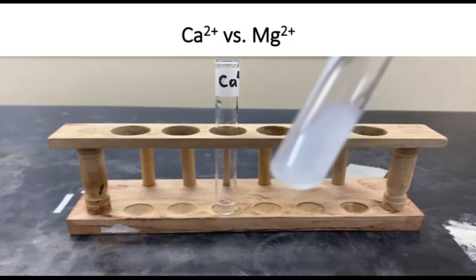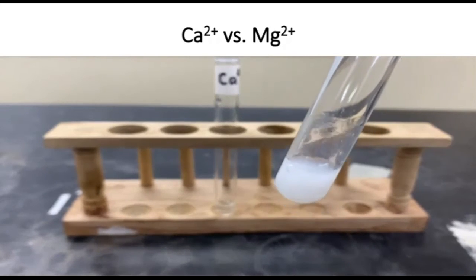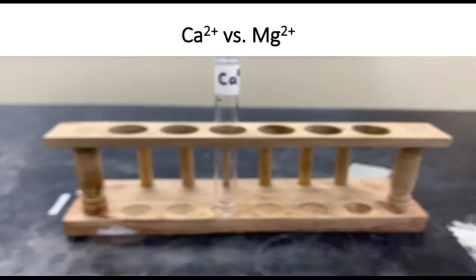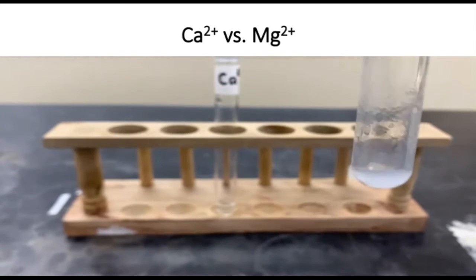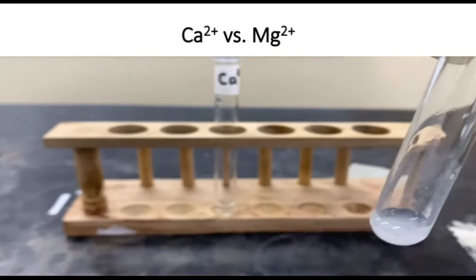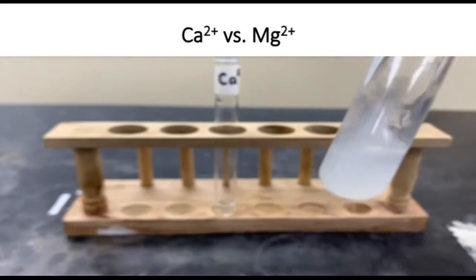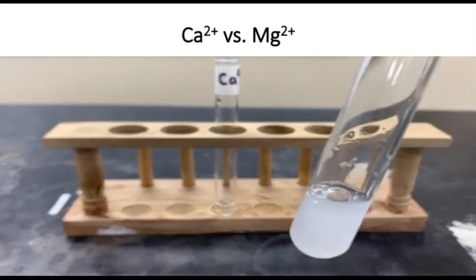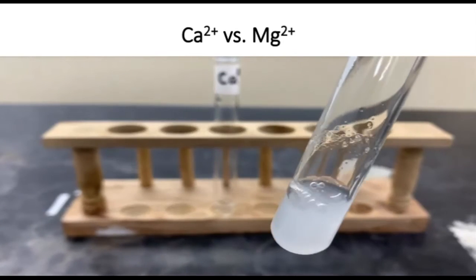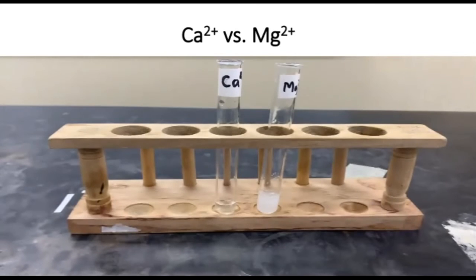And there we're seeing we've gotten a white precipitate. We're now going to pour off most of this precipitate so we can check to see if it is soluble in excess aqueous ammonia. So we're going to add excess aqueous ammonia and check, and we're seeing that our precipitate is insoluble. So that's our magnesium ions.